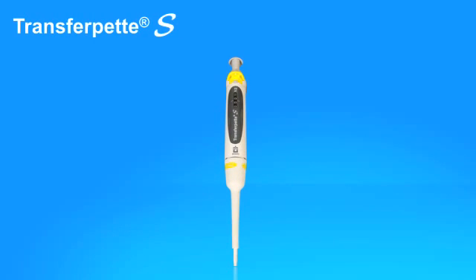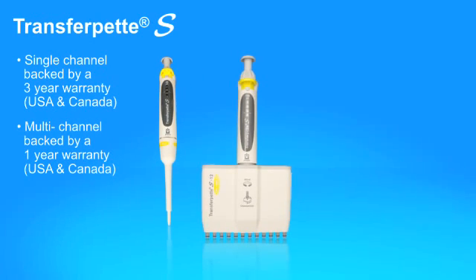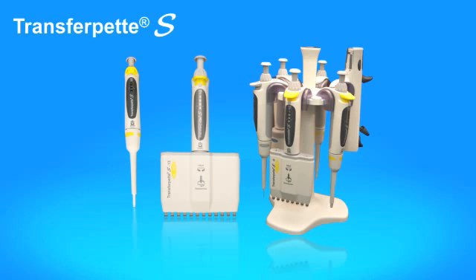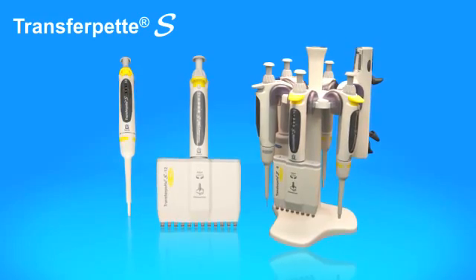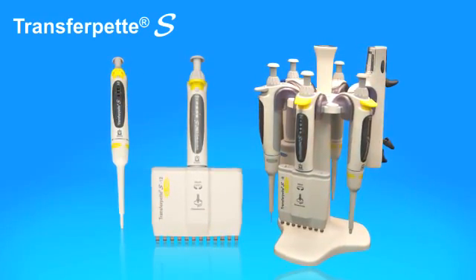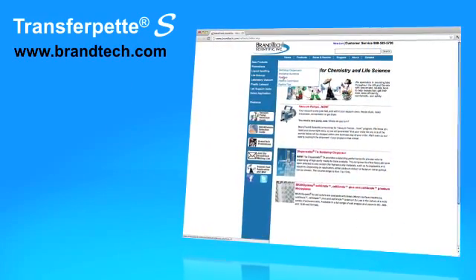The TransferPet S single channel pipettes are backed by a three-year warranty. Multi-channel models have a one-year warranty, and all instruments ship with a performance certificate. Innovative design features, advanced materials, comfortable and easy to use — the TransferPet S sets a new benchmark for pipettes. For more information, visit Brandtech.com.